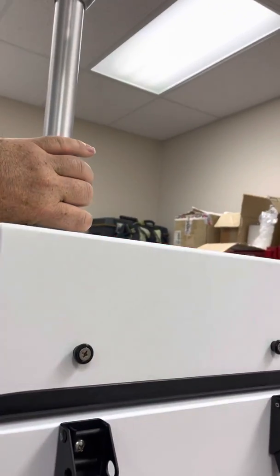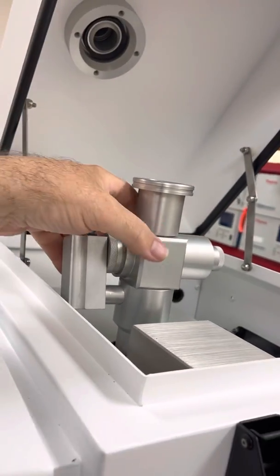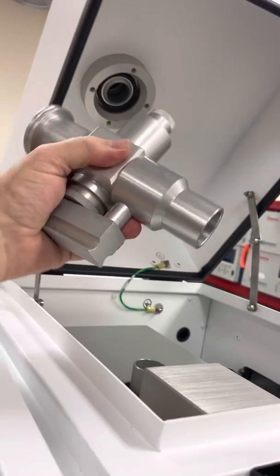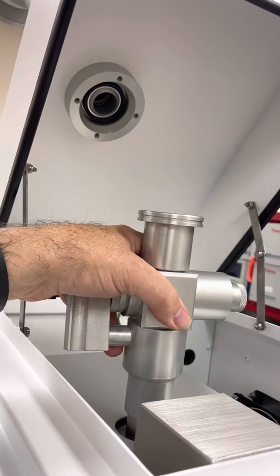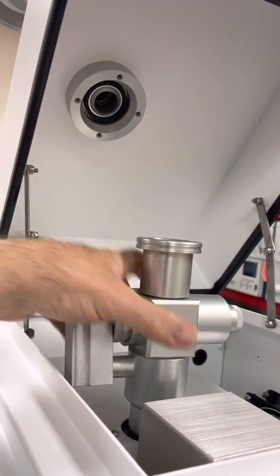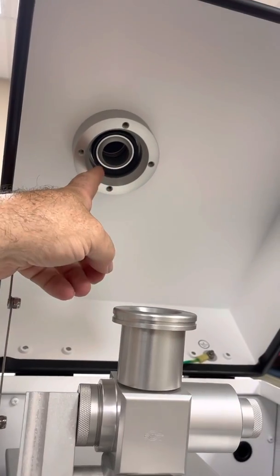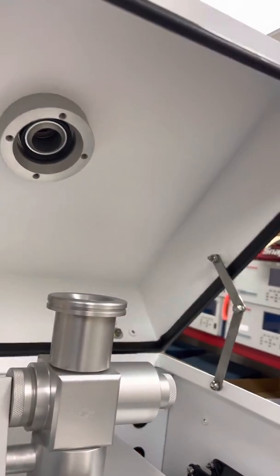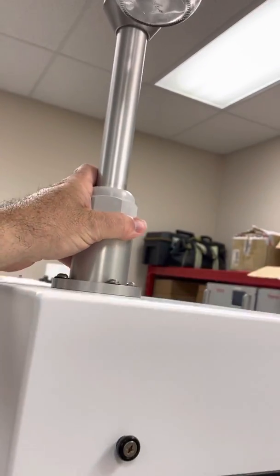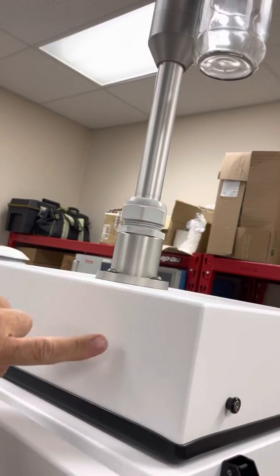If I open this cover, just below the PM10 inlet, we can see the 2.5 sharp-cut cyclone — it just pops off. They've located the very sharp-cut cyclone inside the unit. When you close the lid, it just makes a seal with the gasket up inside here, and we have the PM10 inlet with the 2.5 cyclone just underneath.